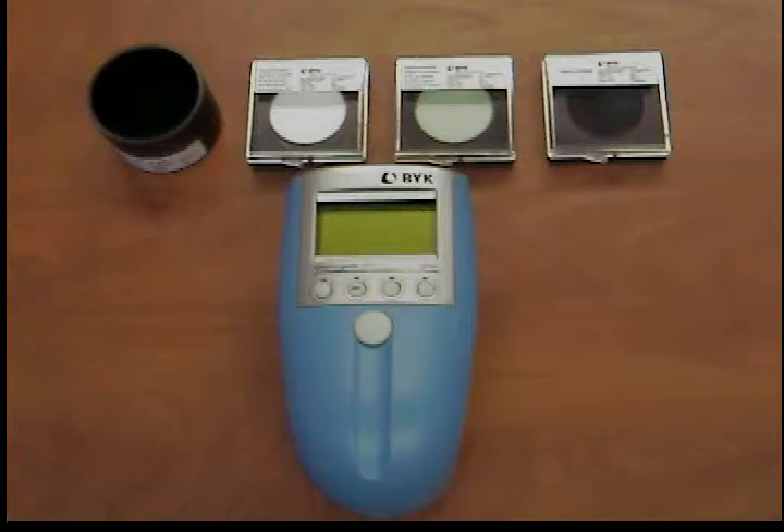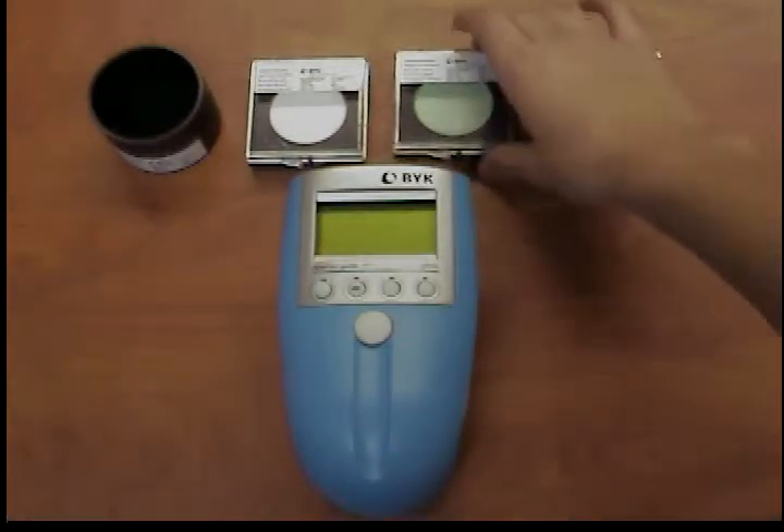Flip open the lid of the standard. Position the measuring instrument so that the display points in the direction of the open lid and the front edge of the instrument is parallel to the edge of the lid. This ensures that you always perform the calibration under the same conditions.